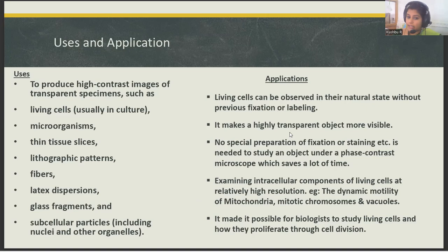Here, highly transparent objects are visible so that the internal detailing is seen. It has very good resolution. Dynamic motilities can be studied. All the metabolism can be studied. Movements can be studied.